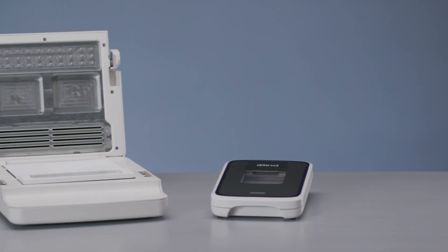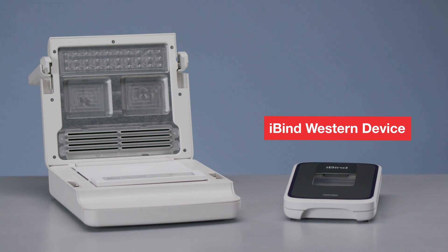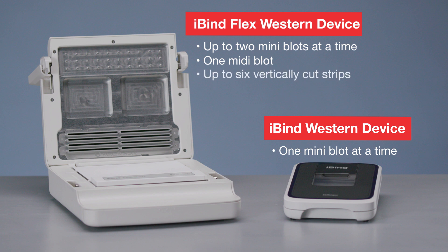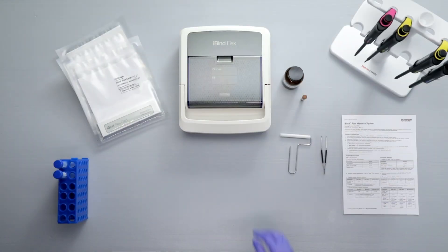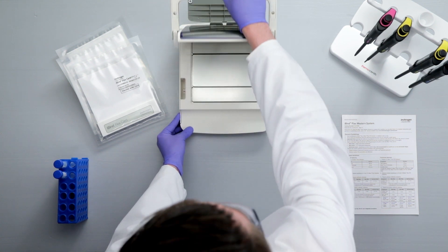In this video, you'll learn how to use the iBind Western Systems. Two iBind Western Systems are available: the original iBind Western device, which accommodates one mini blot at a time, and the iBind Flex Western device, which accommodates two mini blots, one wide format mini blot, or up to six vertically cut strips at a time. The iBind Flex uses interchangeable well inserts to accommodate the blot format.